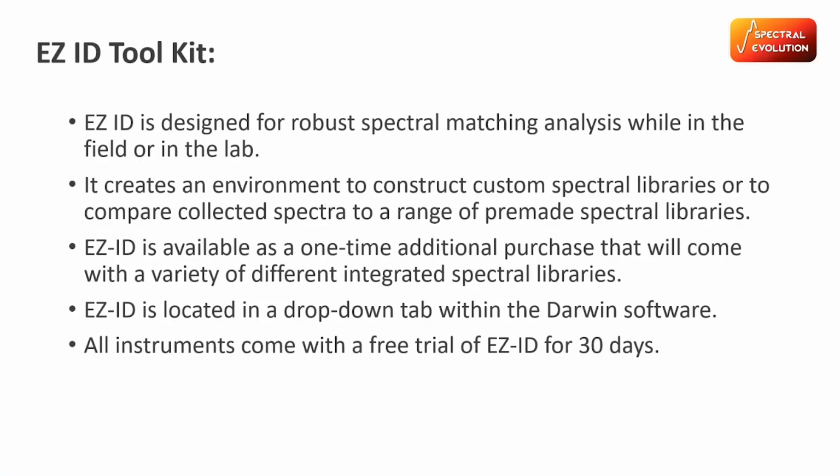So this tool, the EZ-ID tool, also allows you to create your own custom libraries for specific applications. And it is an additional software. It does not come with the instrument, but it's a one-time purchase, and all of our instruments come with a 30-day trial for the EZ-ID tool.